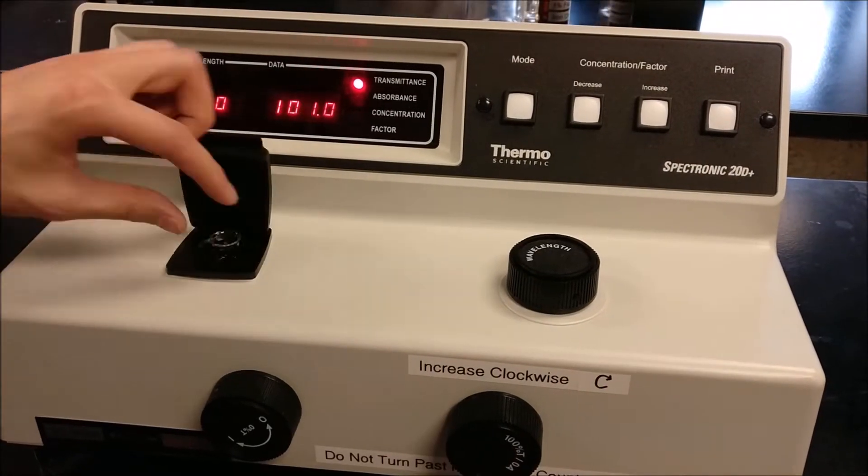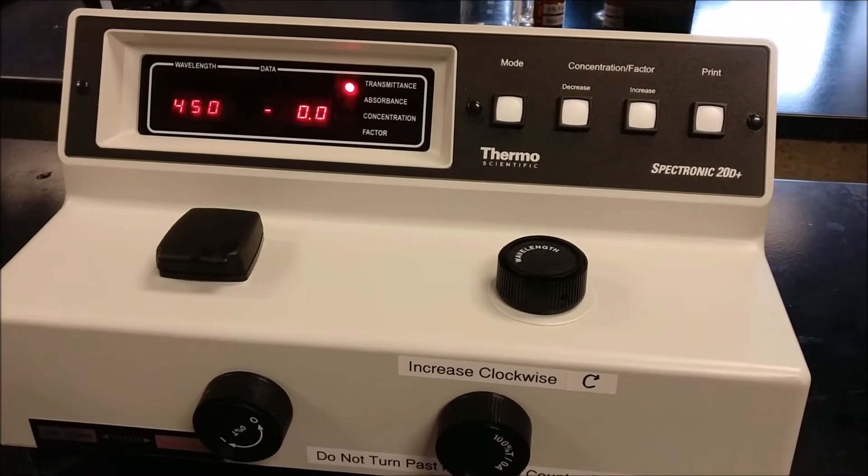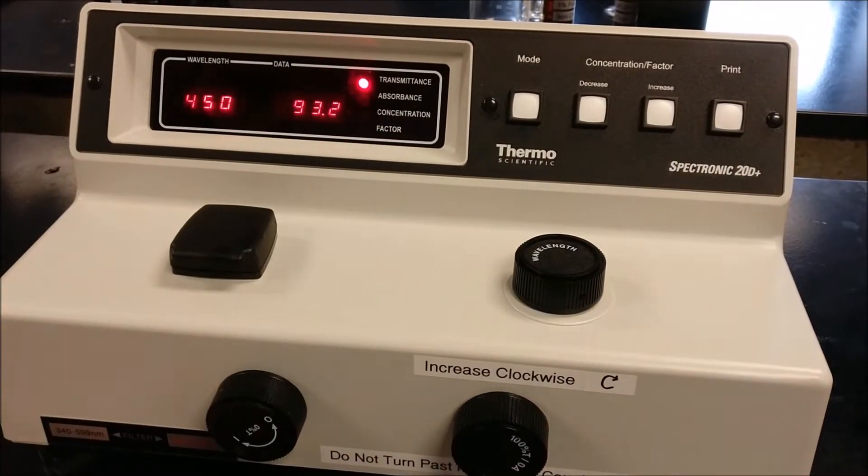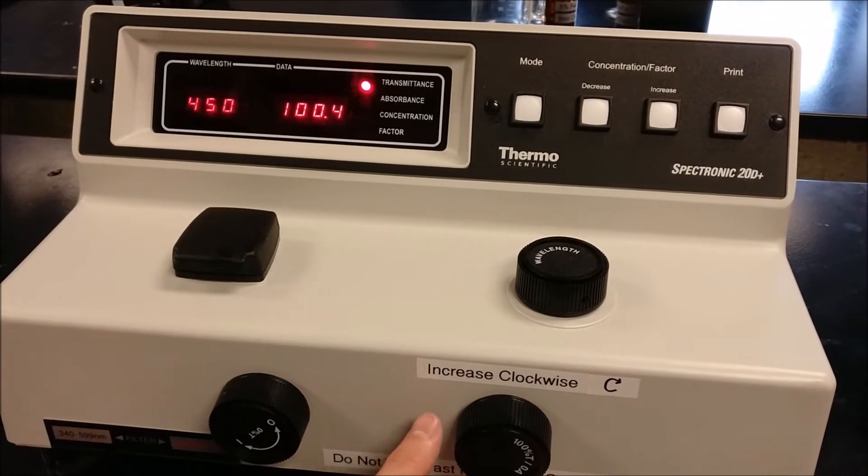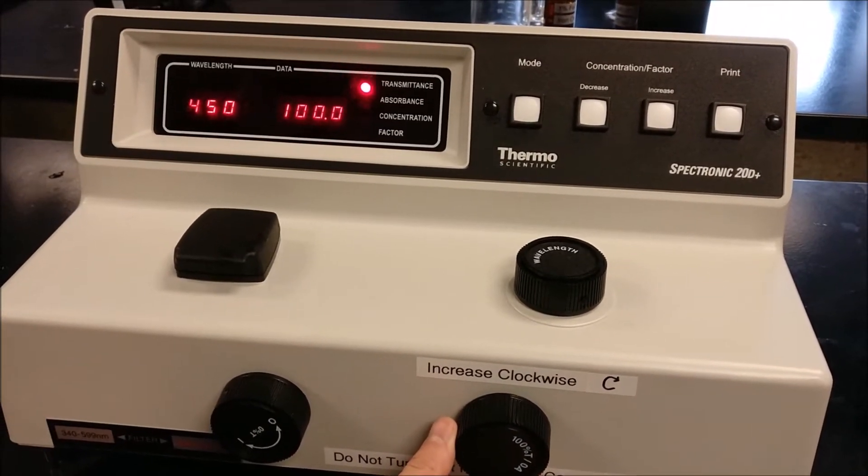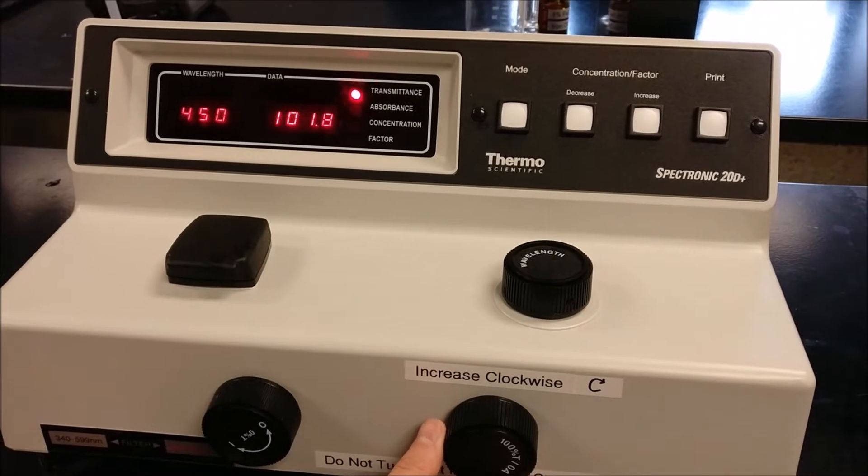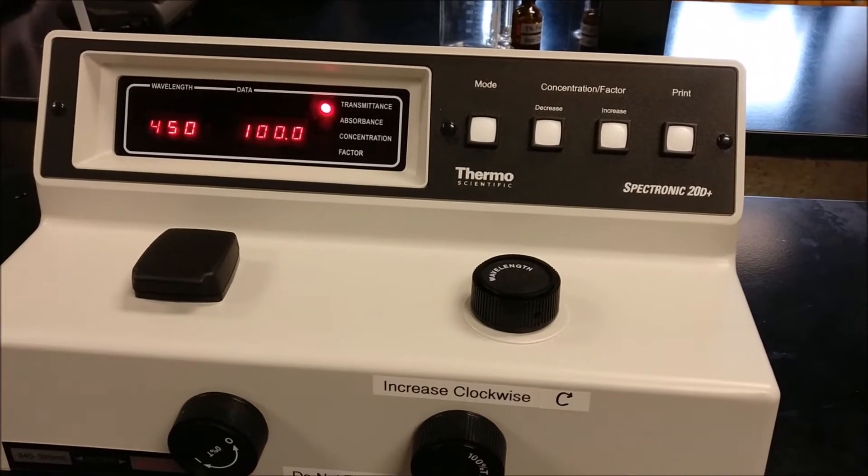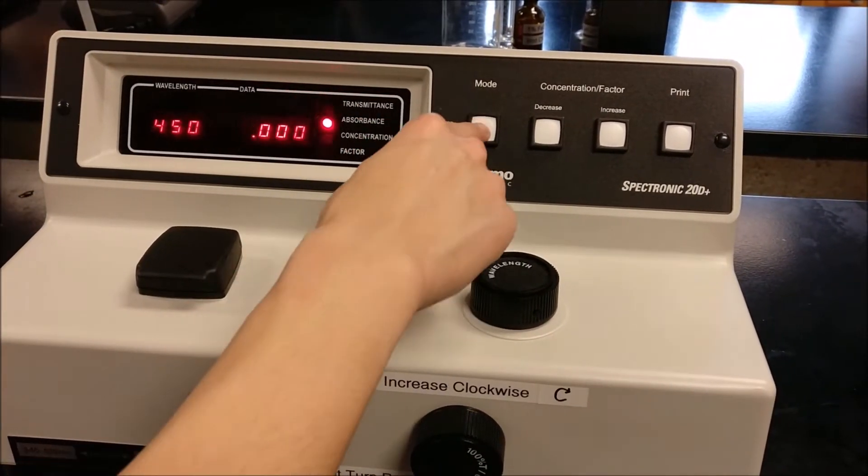Then take the test tube and close the sample holder and see if the transmittance goes back to 0. If it doesn't, recalibrate it. Then put the test tube back in. If the transmittance doesn't go back to 100, recalibrate it using the 100% T knob. After the calibration is finished, set the mode to absorbance.